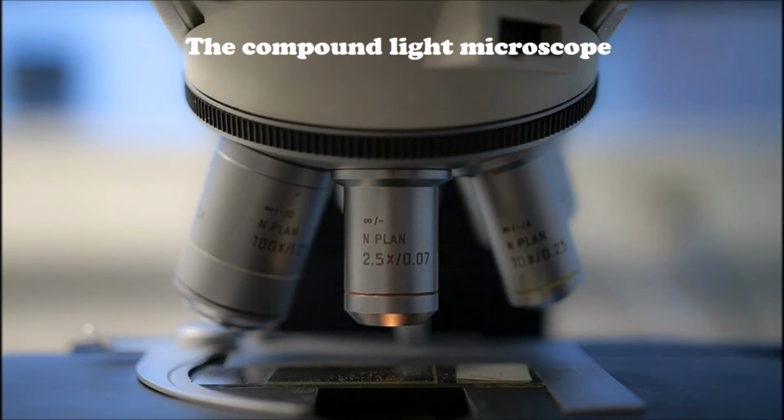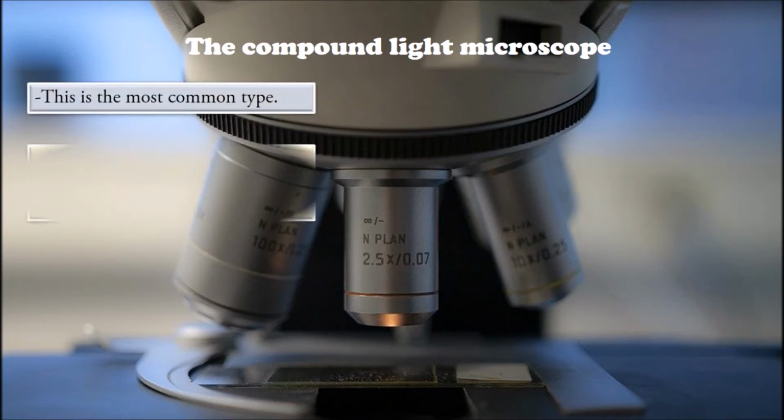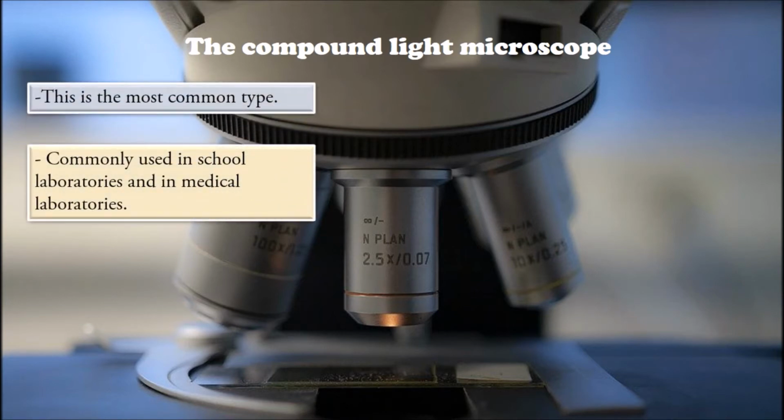The compound light microscope. This is the most common type. It is commonly used in school laboratories and it is used in medical laboratories as a diagnostic tool. First, we will look at the parts of a light microscope and their functions.